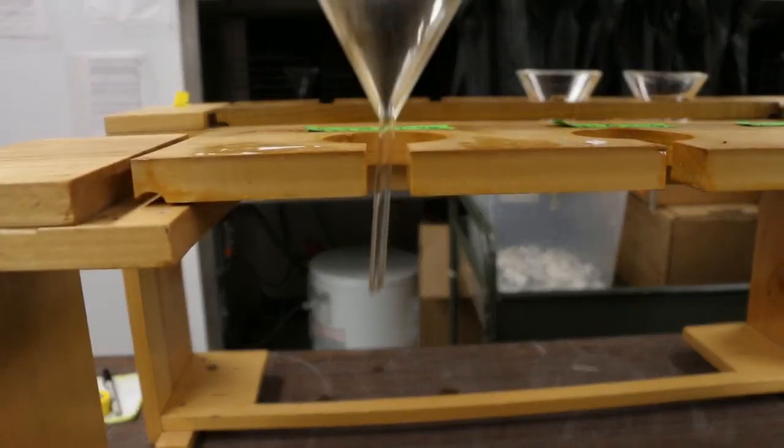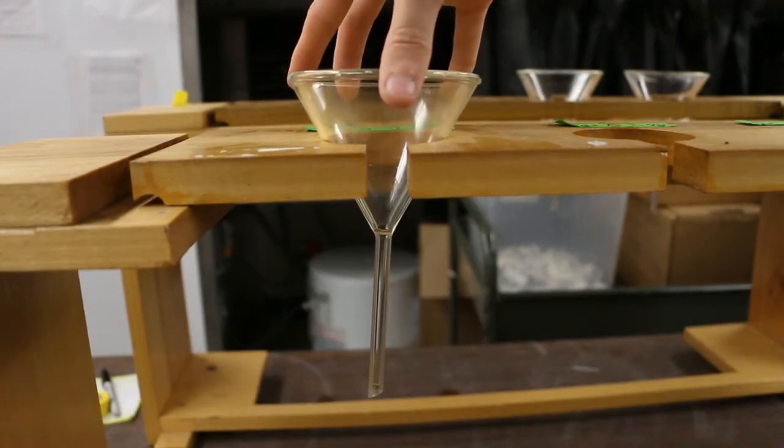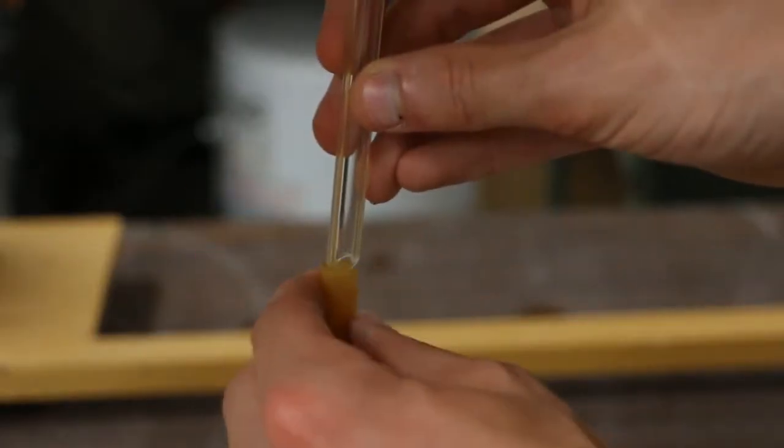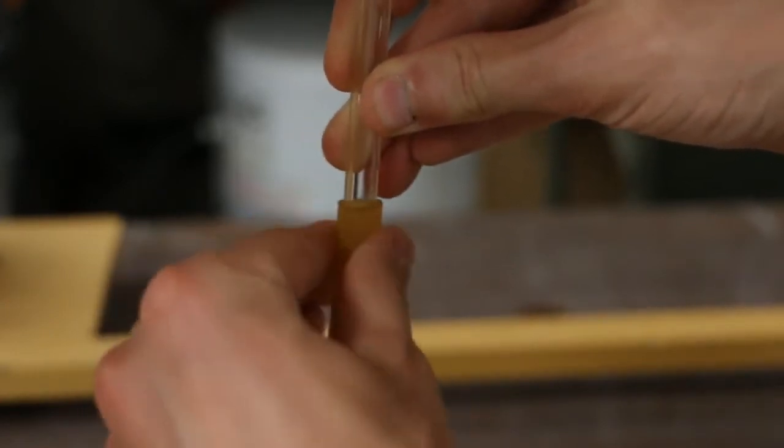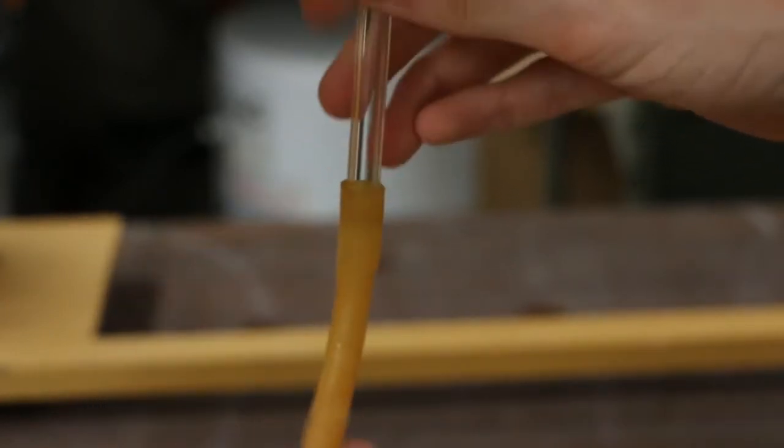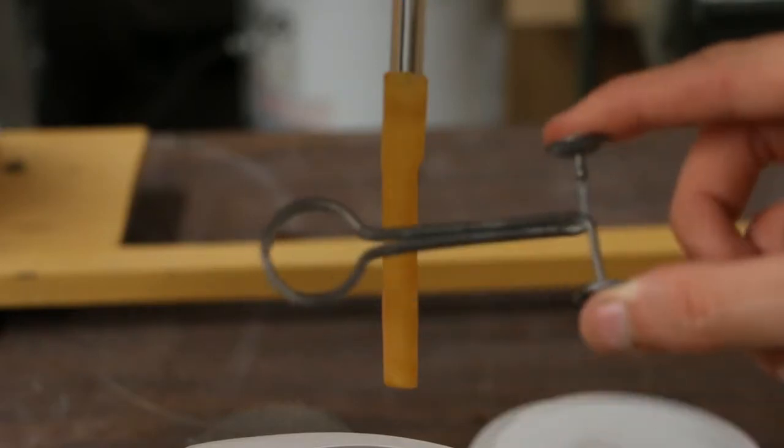Begin with the funnel. Attach the rubber tube to the mouth of the funnel and clamp it shut. Once the trap is filled with water and the nematodes crawl through the filter paper, they'll sink to the bottom, and this is where you'll collect them later.